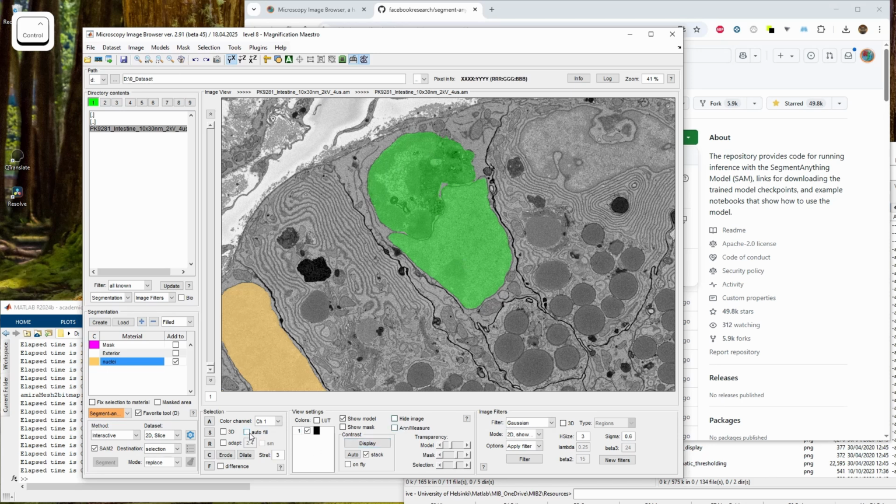I can also press this autofill button, which I probably recommend, and what happens in this case, it kind of fills the holes in the segmentation area. So for example, you see here this area there's a hole, but let's say I don't want to have it, and I click again in the first and then the second, and you see that area gets filled, and I provide the control click to exclude that part from the segmentation. So sometimes there are small holes appearing when the models are used, and then you can a little bit tolerate this by having this autofill checkbox.